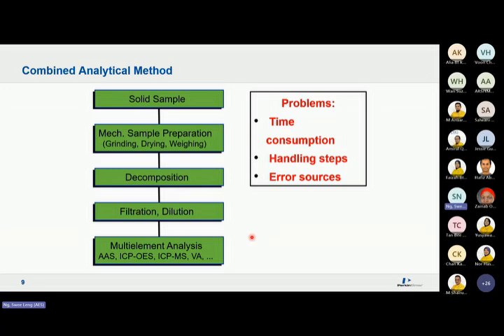Actually, the art of digesting a sample fully is in your chemistry. You need to know, oh, this rock is high in tin, so I must use HCl to digest. If I would like to study the gold in this sample, then I must put in HCl for it to dissolve fully. If I'm going to run rare earths, the majority of the rare earths like nitric acid, so I must have nitric acid.